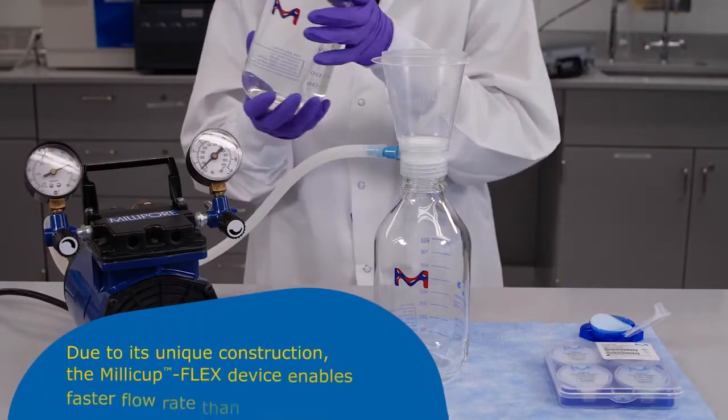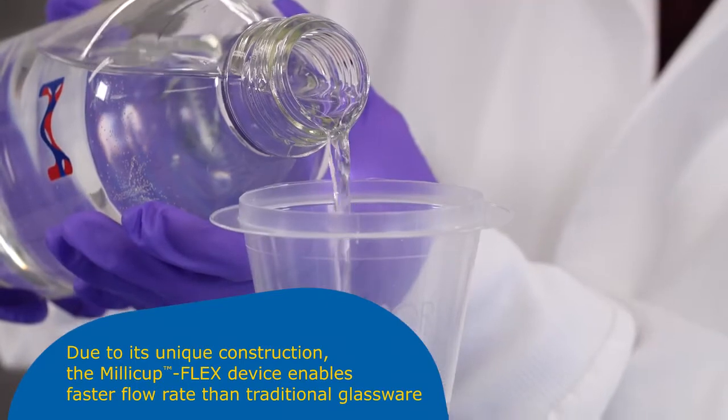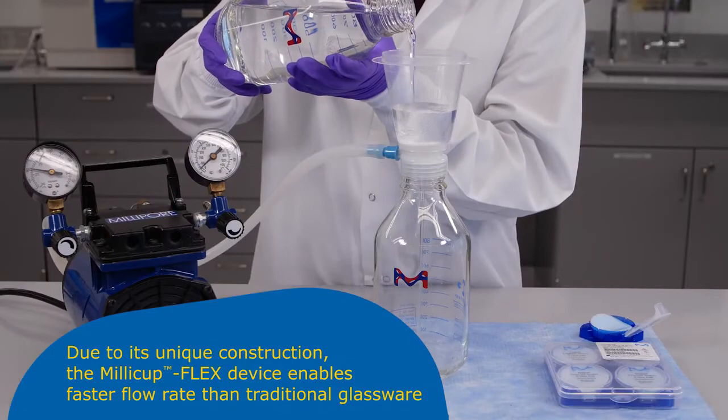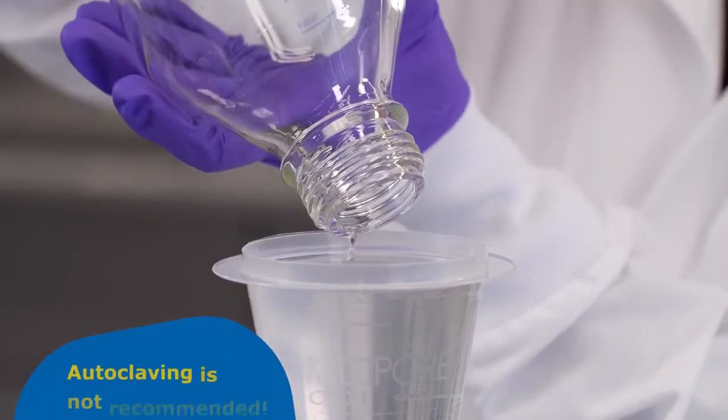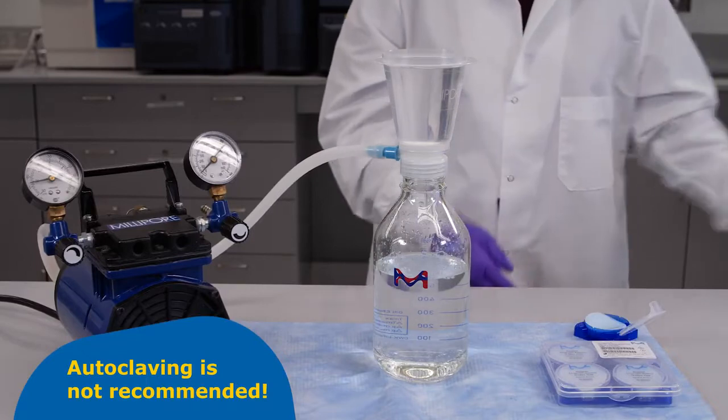Like the conventional glass filtration setup, the Millicup Flex comes with a conveniently sized 250 milliliter funnel, which can be refilled to accommodate a wide variety of solution volumes. The filtrate rate and volume is restricted only by your choice of membrane and the size of your receiving bottle.